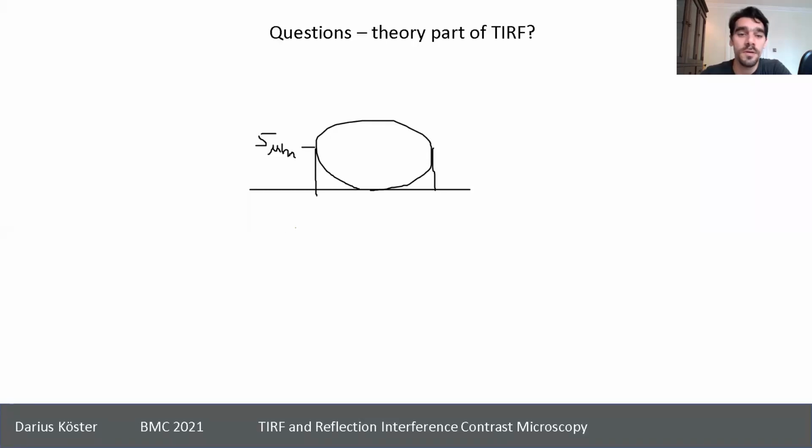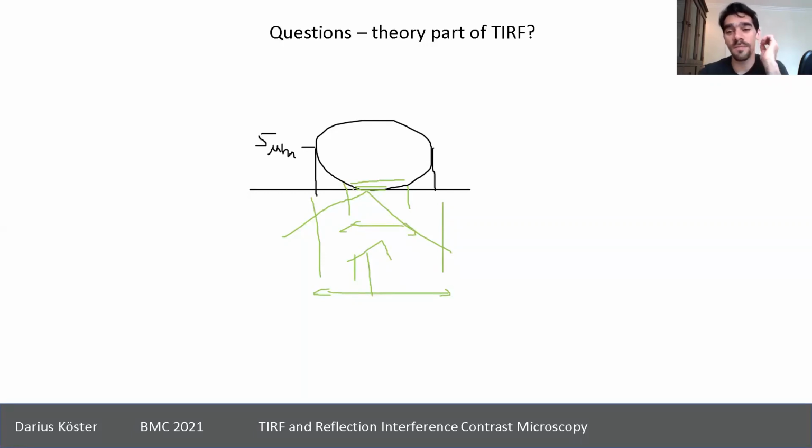So if I come in now and I just have my evanescent field, let's say till here, you get this signal. And then if you go with epi light, everything through, you get that signal. And then you can compare what's that with, this with, and that with, and then you do some geometry and you get a rough idea whether you actually get a reasonable TIRF field.